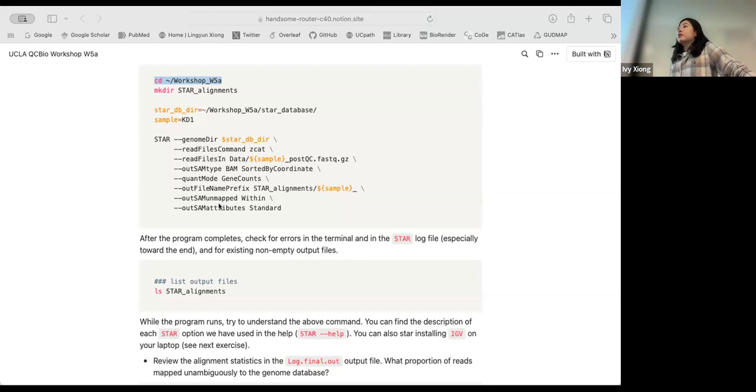And then you have to check the individual core. Some cores have bigger RAM. So if you need that much short-term memory, you want to make sure you request a specific core that has that capacity. Another option, if you need more RAM, is to go to GPUs instead of the standard Intel CPUs. So this is more of a technical aspect.